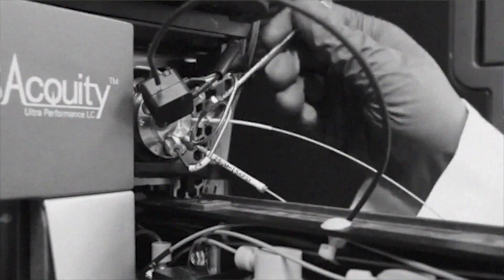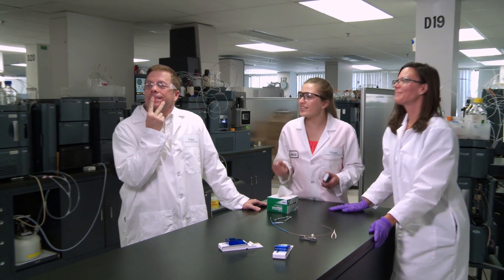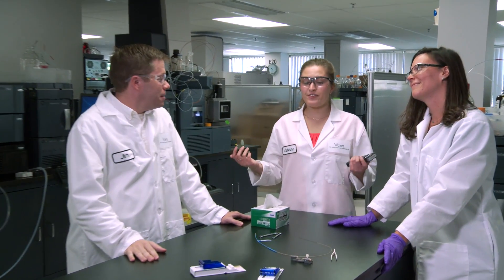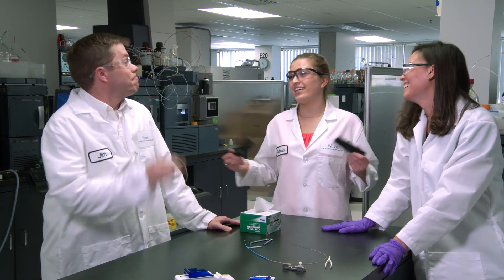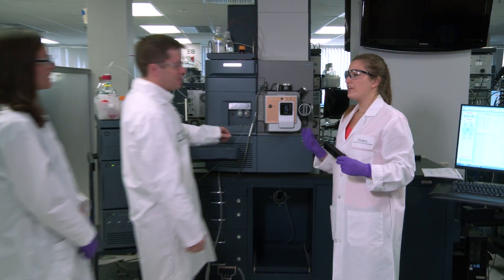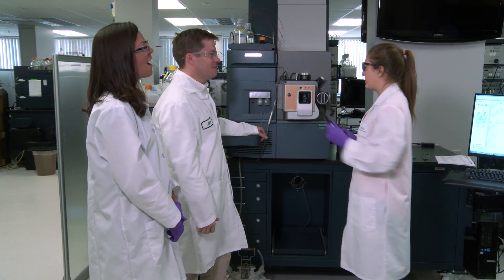Jim? Jim? This always happens. Jim, snap out of it. It's the 21st century now. We can just use the Ion Key. That's right — come on over and I'll show you how all those pieces you're used to working with are now in one easy-to-use device.